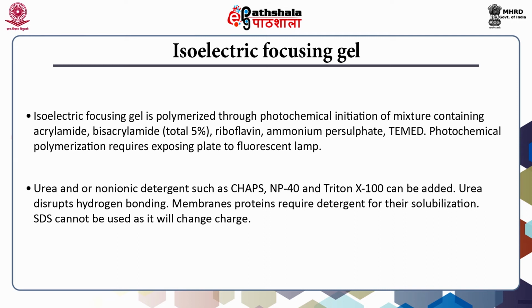Urea disrupts hydrogen bonding, which otherwise can lead to aggregation of molecules and affects its mobility. Membrane proteins require detergent for their solubilization. Sodium dodecyl sulfate cannot be used as it will change the charge. Photochemical polymerization requires exposing plate to fluorescent lamp.